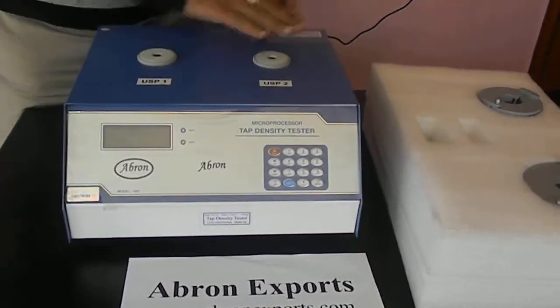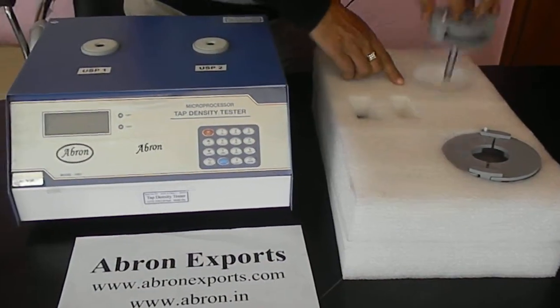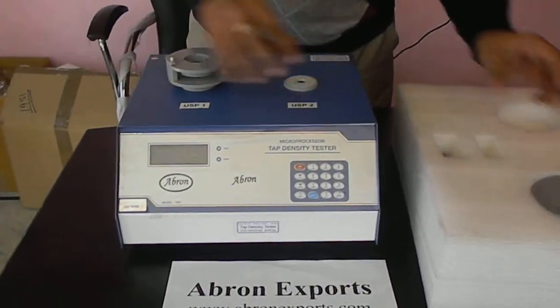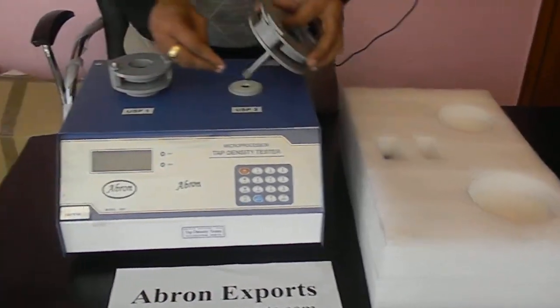There are two parts — you will find there are two holders. One is a small holder, you can fit it here. And another one, a big one, you can fit it here.